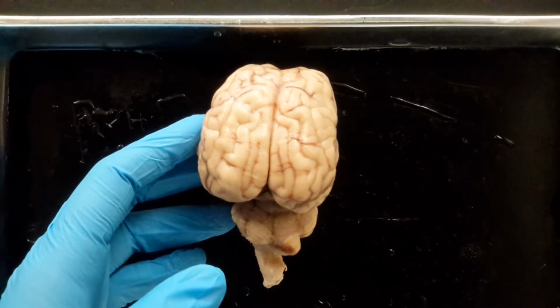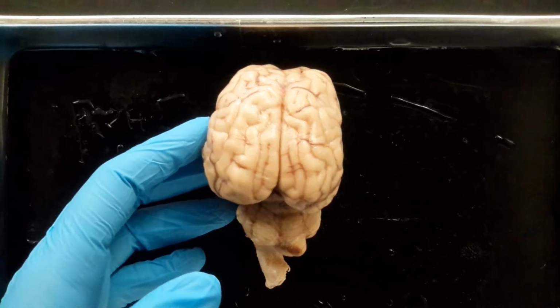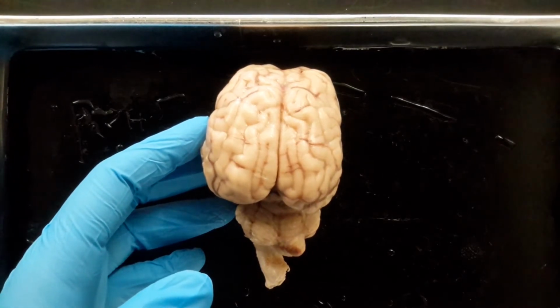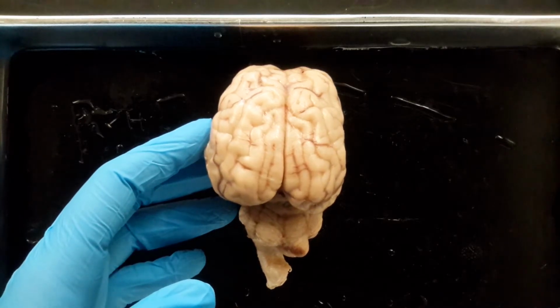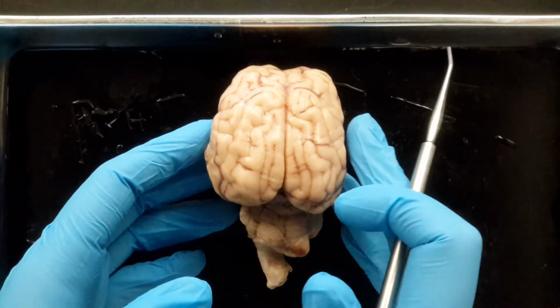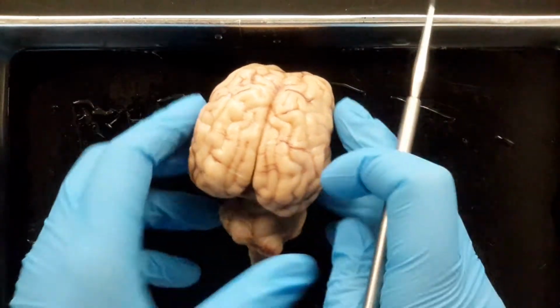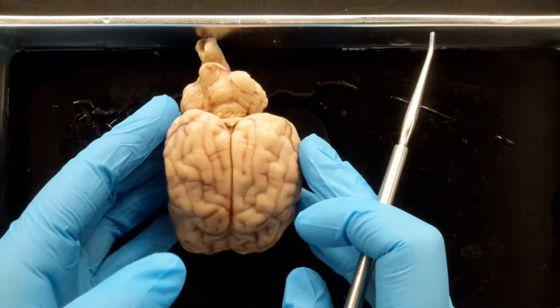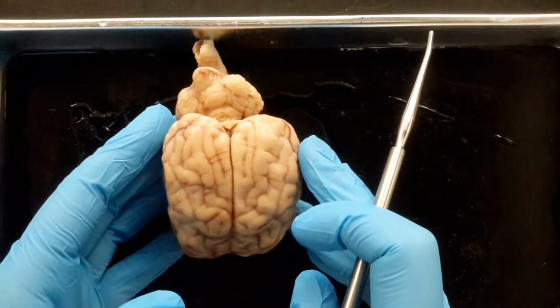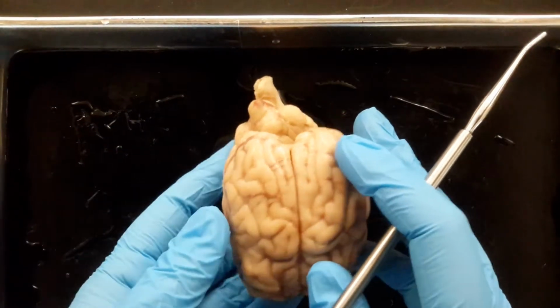Okay, so we are going to go over surface anatomy first, and then I'll describe a little bit of some of the work you're going to do on the brain before we bisect and look at the internal structures. Okay, so I'm holding the brain. It's actually opposite. Let's see. So to you, that looks anterior. Yes. Okay. So I'm going to hold it in the anterior view for you.